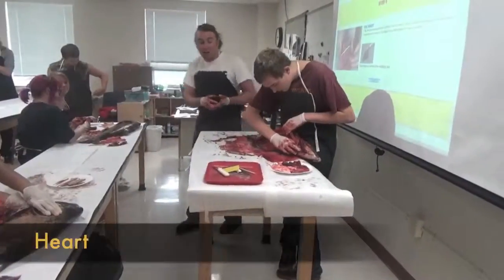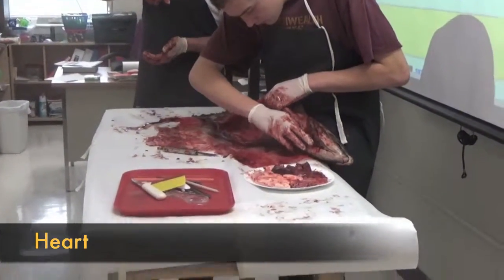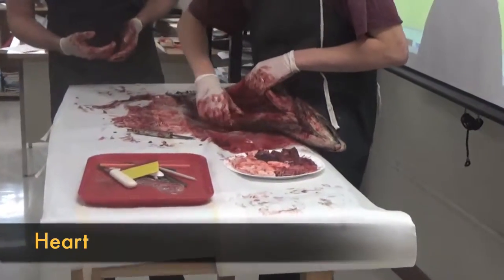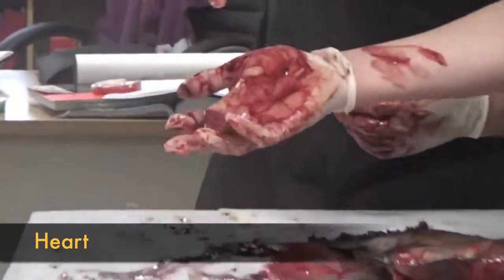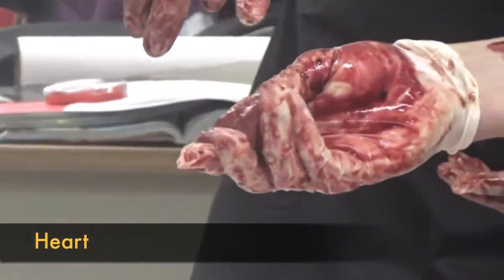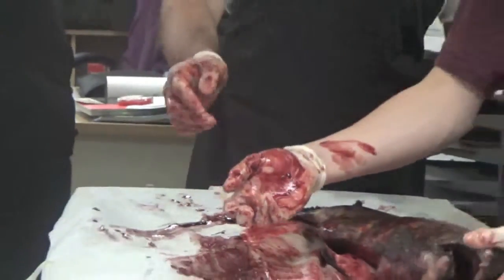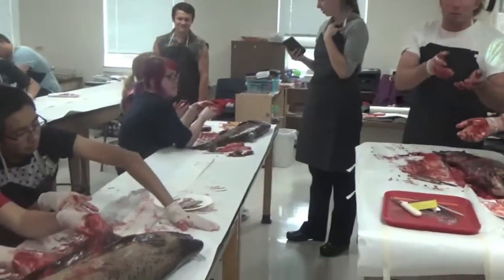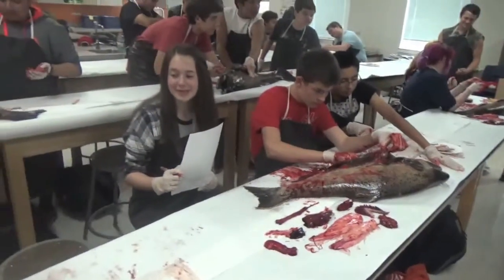The heart is going to be closer to the head. Everybody watch Brandon — he's going to pull out the heart. It's a little triangular piece. Just think about all that blood that we're looking at here — it's all pumped through this whole fish through this little heart. It's proportional — little on the outside, but what a workhorse that little organ is.